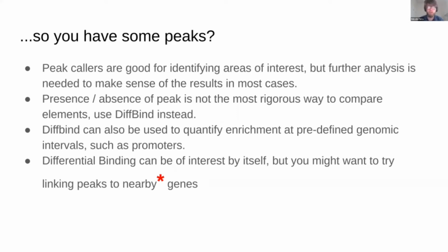It's worth noting that you can do this kind of analysis with other forms of annotation. You don't have to be using peaks from enhancers. You could use promoters, for example, or any other annotation you're interested in, or any transcription factor ChIP peaks. I think in the original Diffbind paper, they used transcription factor binding peaks at promoters in certain cancer samples to look at differential drug resistance. I think that was the idea.